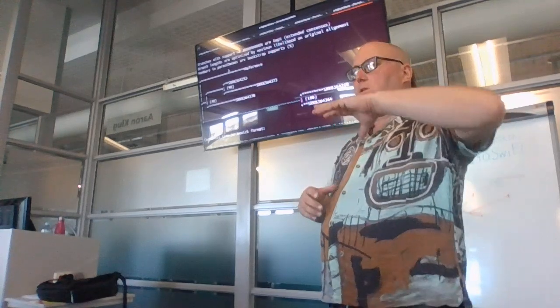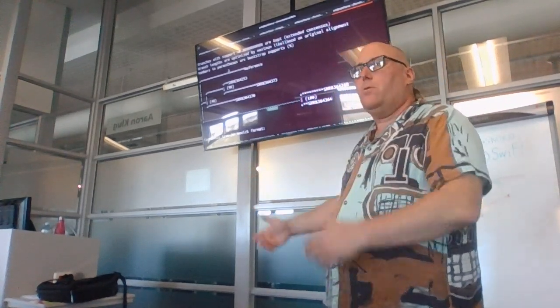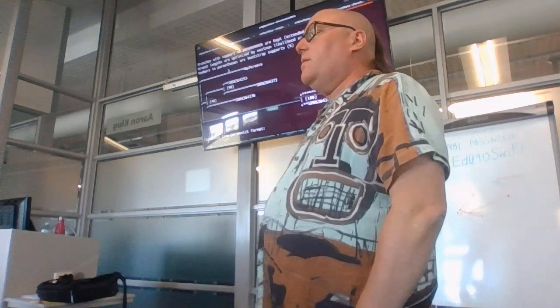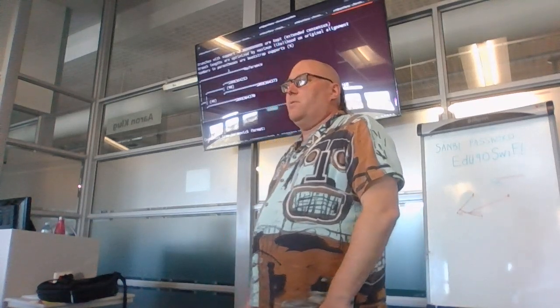So that looks like a whole lot of SNPs, because it's actually another species. I went back to the people who generated the data, and they assured me that they'd done all the biochemical tests and whatever to make sure that this was Mycobacterium tuberculosis. But we've never resolved how that ended up in the data.